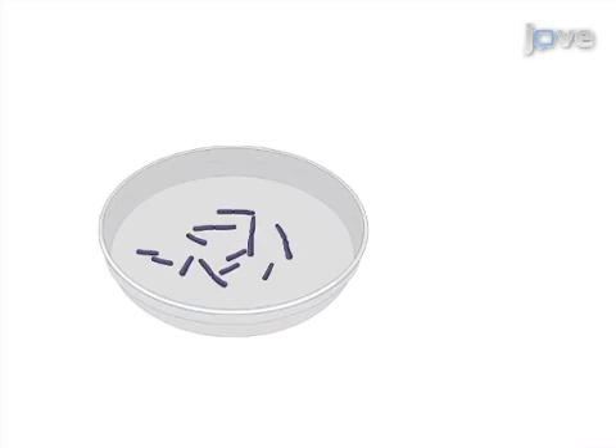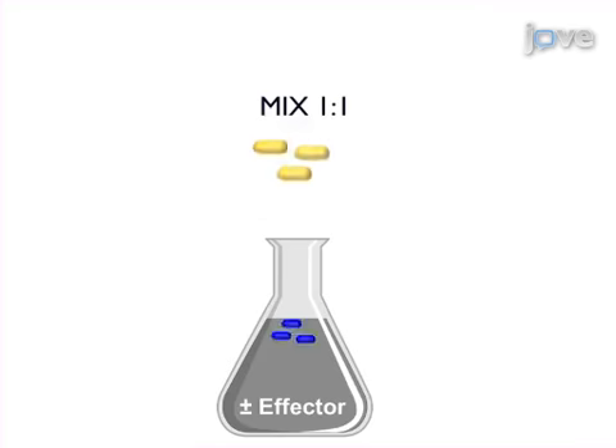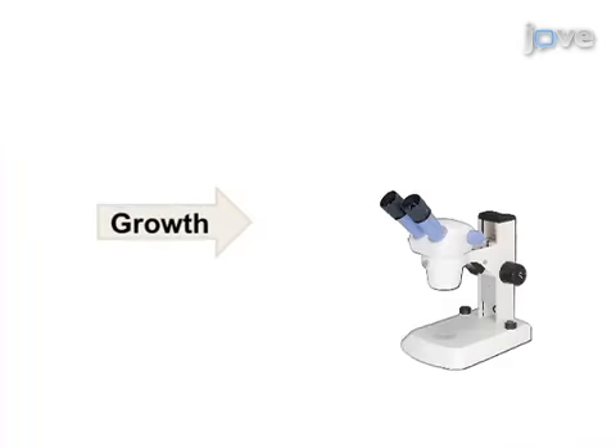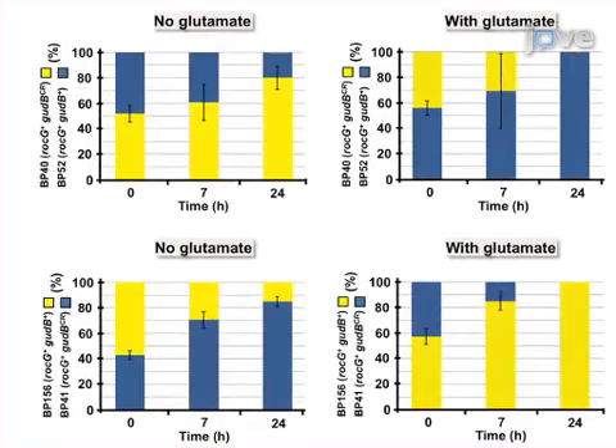First, prepare the pre-cultures of the bacteria for the competition experiment. Mix equal amounts of the fluorescently labeled strains and co-cultivate the bacteria under different nutritional conditions. Then collect the samples at different time points, dilute appropriately, and propagate the cells on agar plates. Now visualize and count the surviving strains by stereofluorescence microscopy. Ultimately, results can determine the percentage of the surviving bacteria with respect to the whole number of counted colonies.